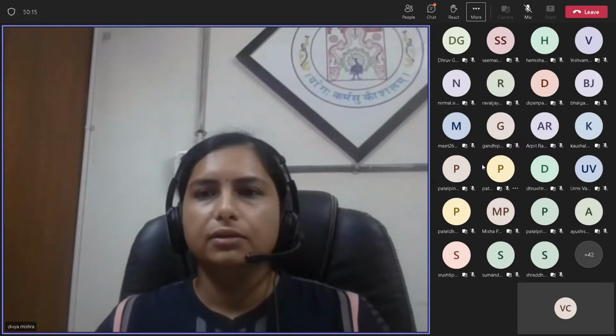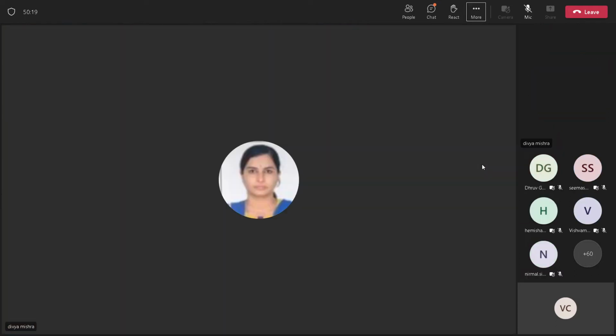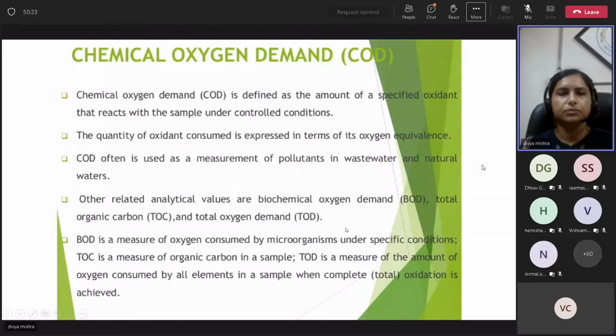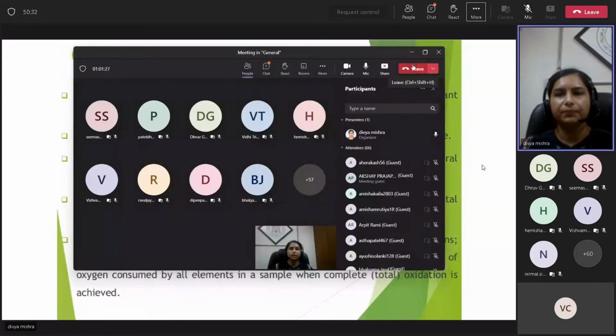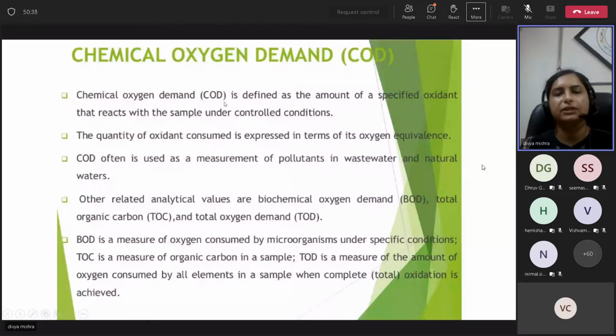Okay. Now we will see the second point, that is chemical oxygen demand. This is also shortly known as COD.